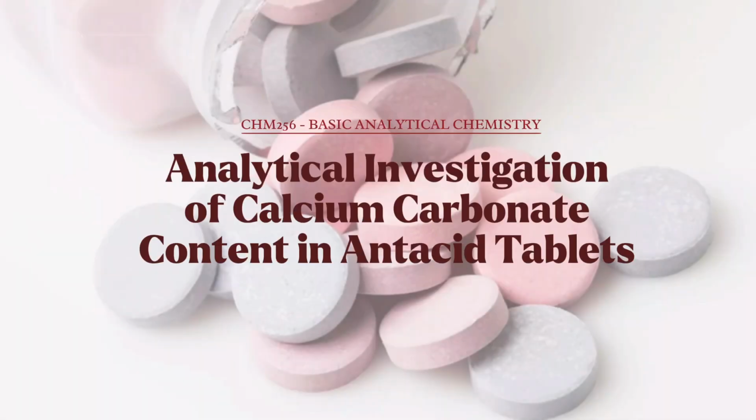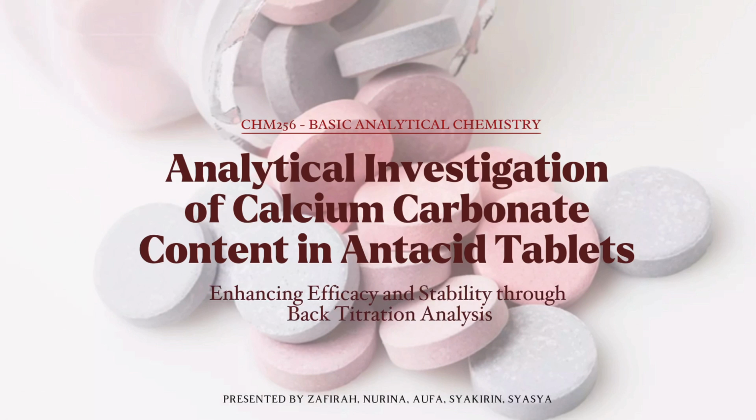Assalamualaikum warahmatullahi wabarakatuh. Today we would like to explain about the analytical investigation of calcium carbonate contained in antacid tablet.